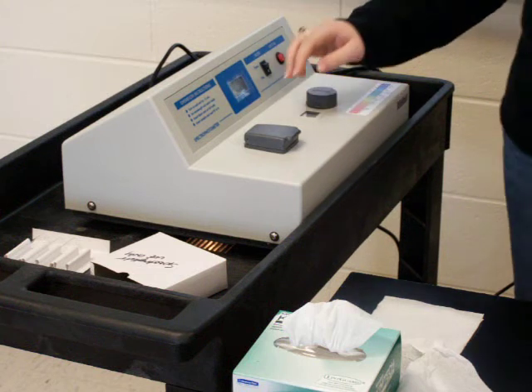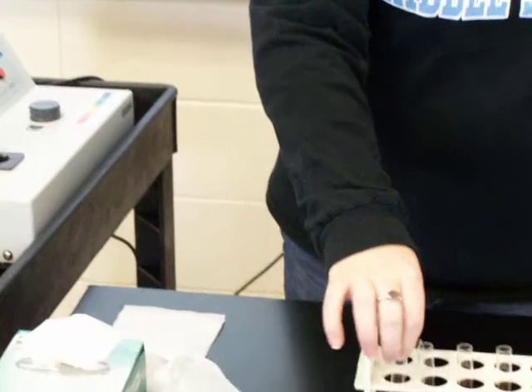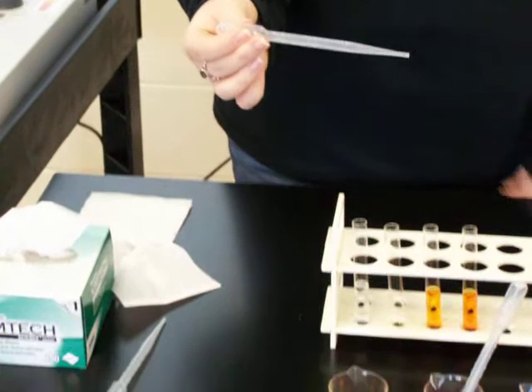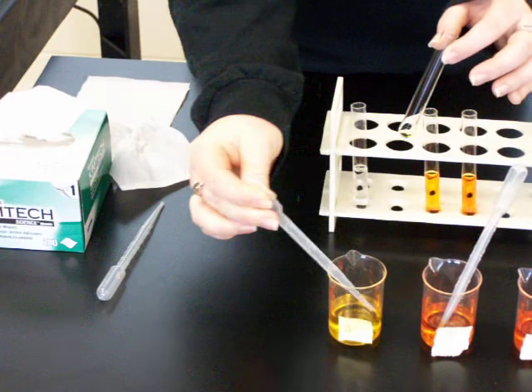Okay, it's at 0. All right, so the machine has been zeroed using a blank. She's now going to take a disposable pipette and measure 4 milliliters of sample A and put it in the next cuvette.